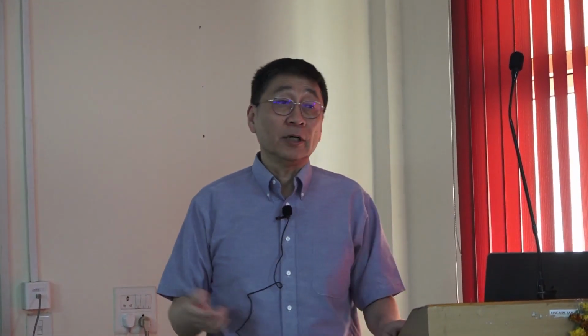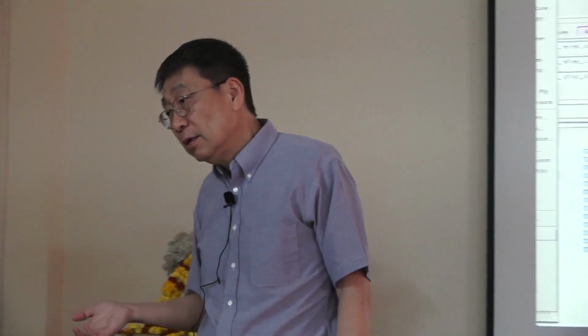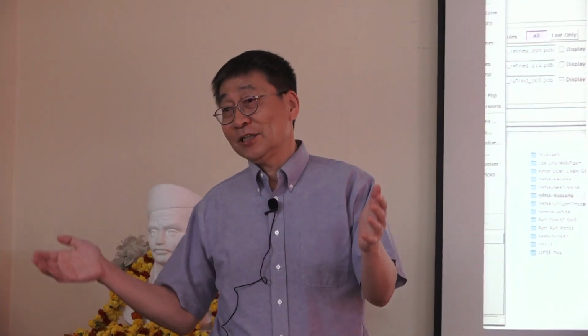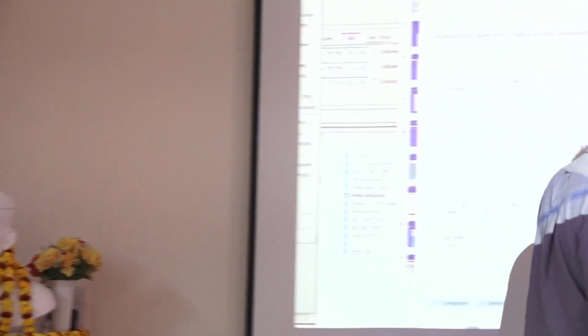Yeah, very useful. We are structural biologists, we use it all the time. So does it work only when homologous sequences are available, or can it work for any new sequence as well? Anything. We do not require any homologous sequences. It's any sequence you put in. Of course, essentially in the end what matters is what you get out of it. So let me show you what you get out of it.